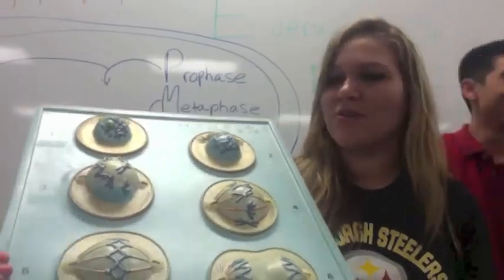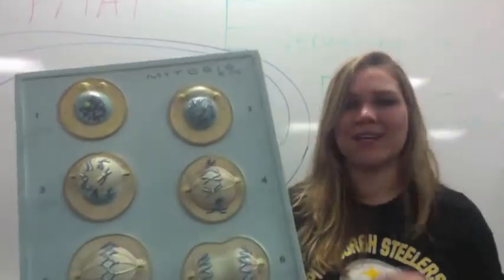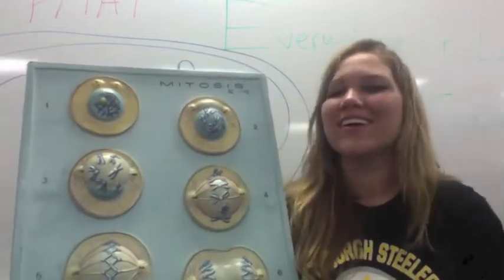So in this video, I am going to be showing you all the different phases of mitosis that you're going to have to know on the lab exam. My name is Morgan, by the way, and that was Leonard.